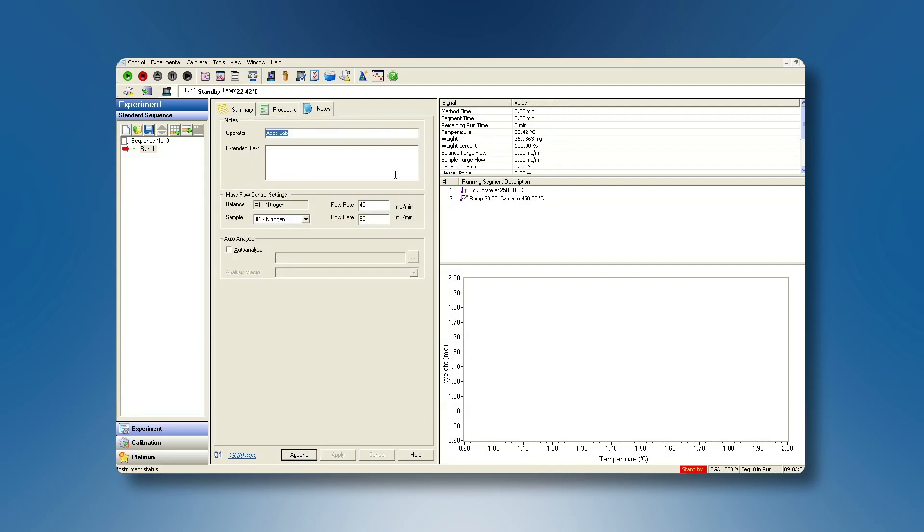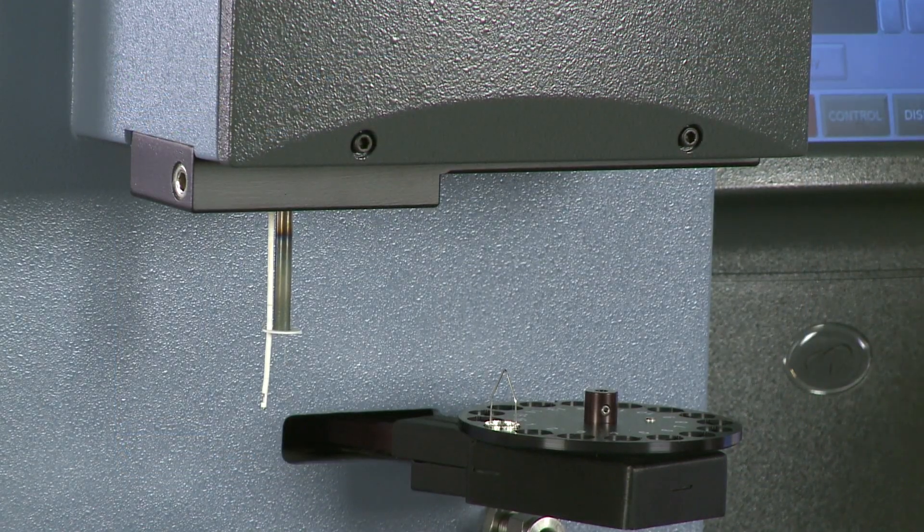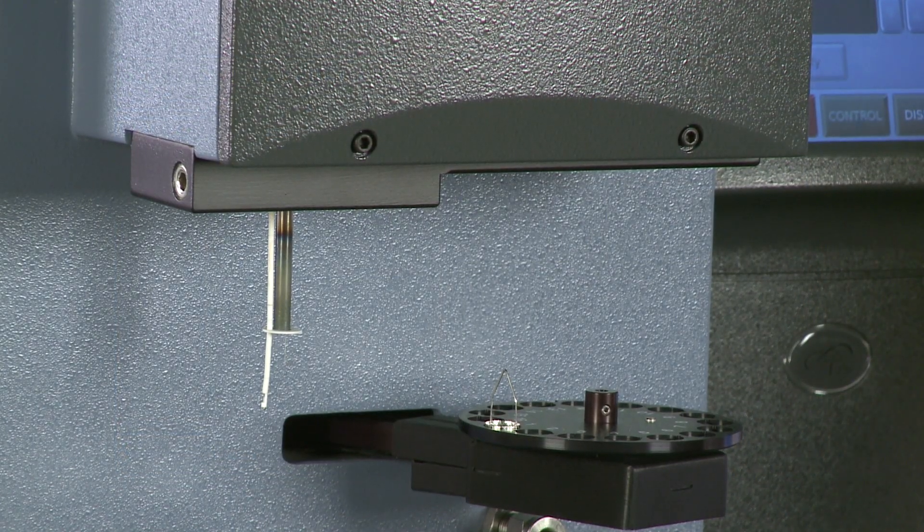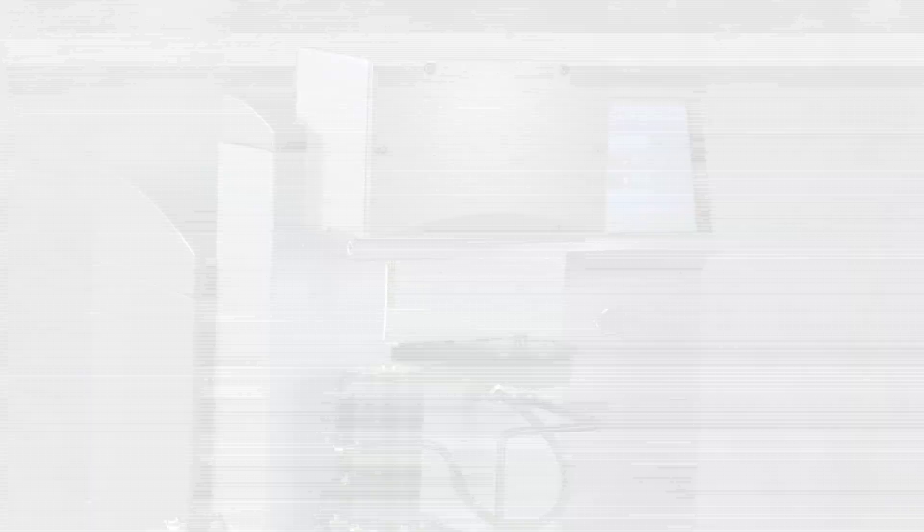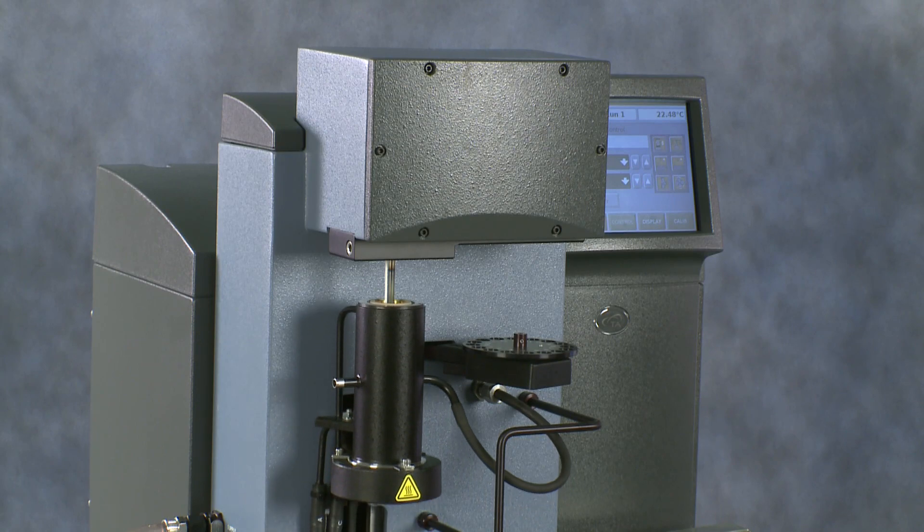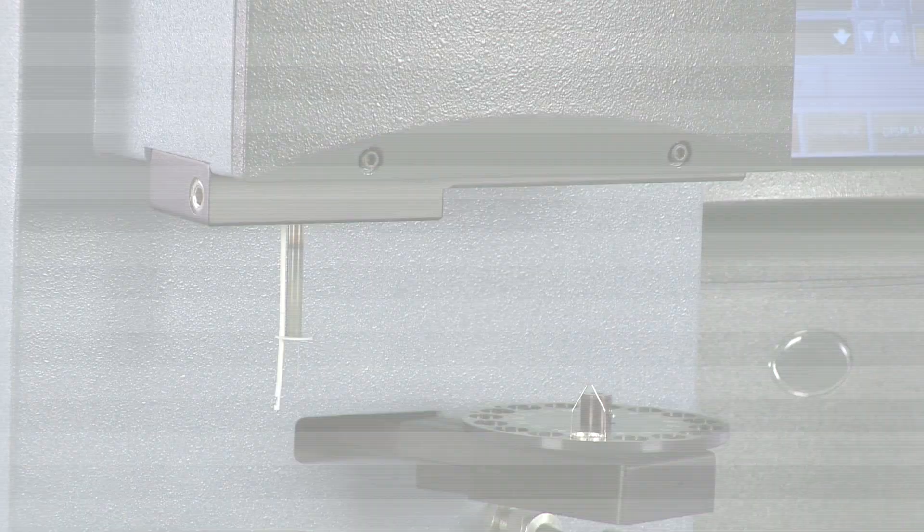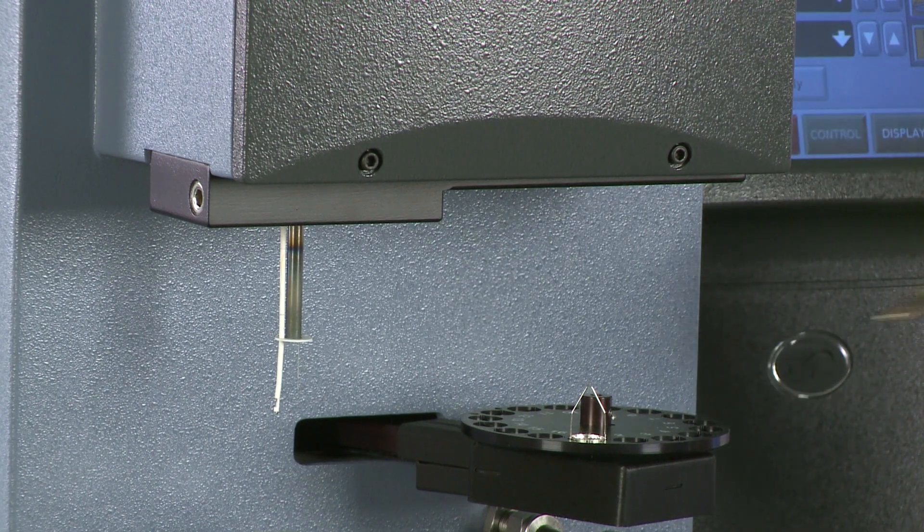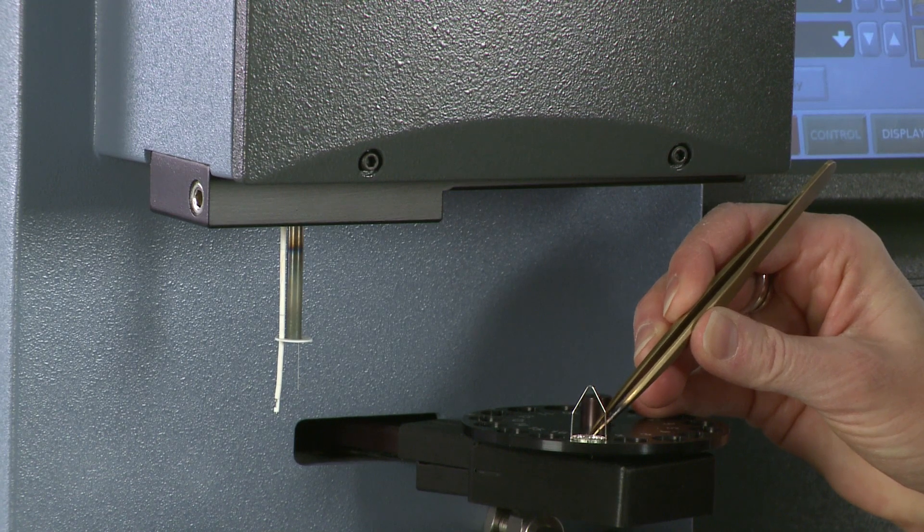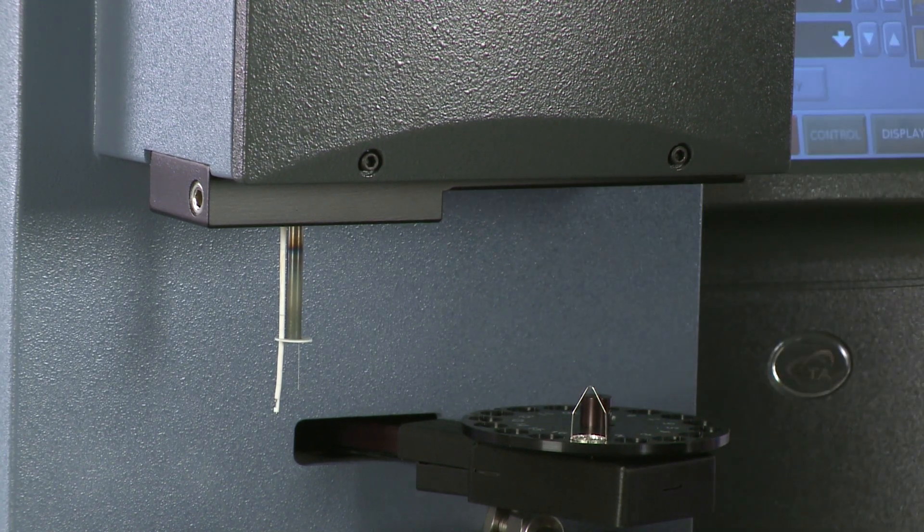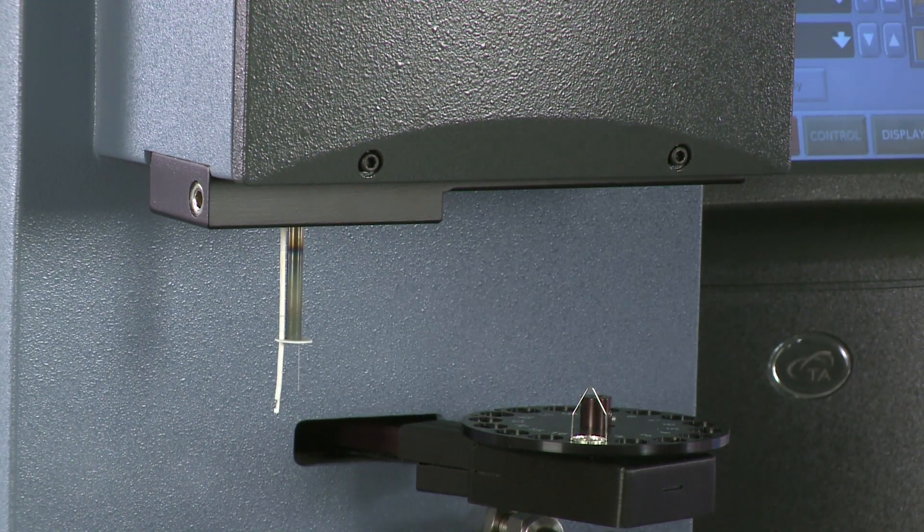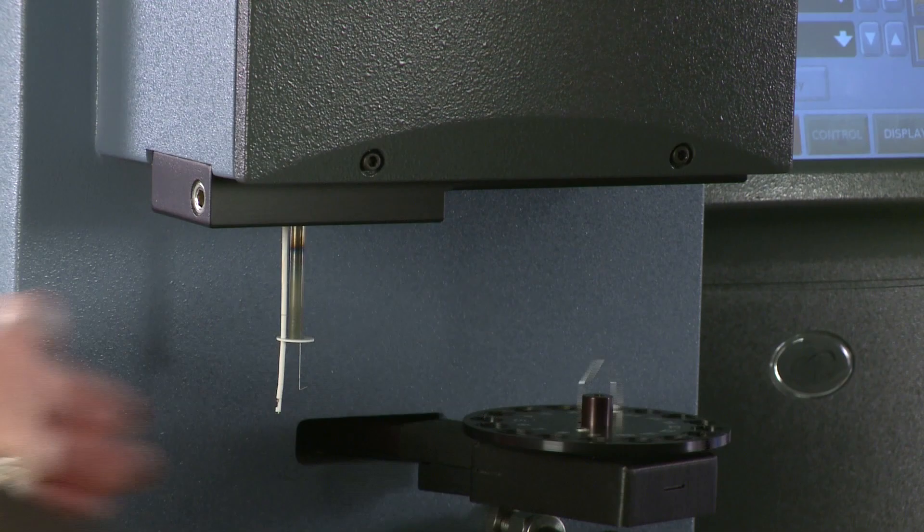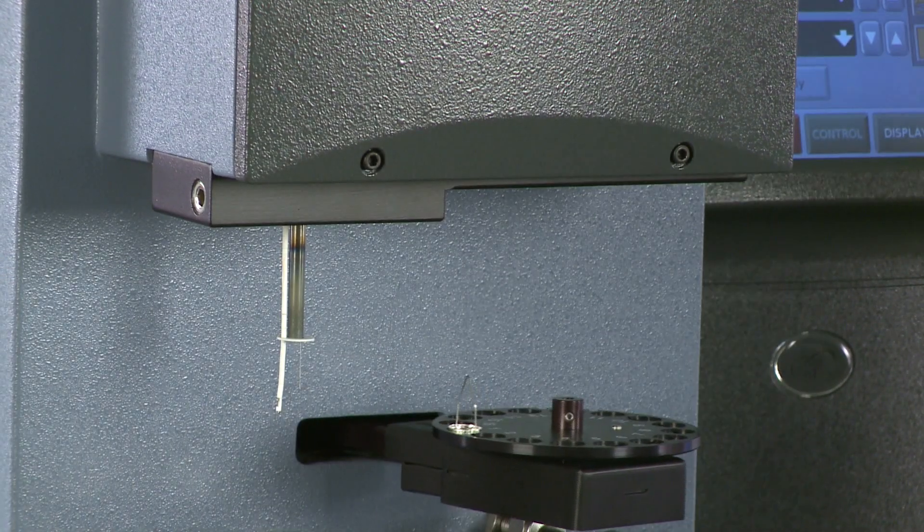Click on the Note tab to enter and verify the information and finally apply to save the parameters for this run. Tare now a clean TGA sample pan.